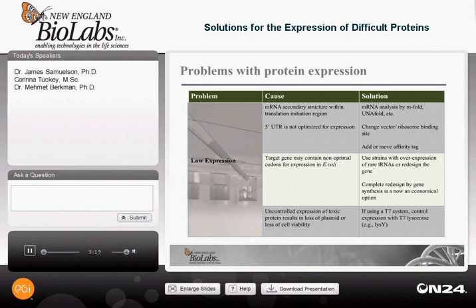Finally, low expression may be due to uncontrolled expression of toxic protein during the culture outgrowth phase. This can result in loss of cell viability or loss of the expression plasmid. Maintenance of the expression plasmid should always be checked by plating cells at the point of induction on drug selection plates versus non-drug plates. Then if the number of colonies on the drug plate is less than 50% of the number on the non-drug plate, then steps need to be taken to stabilize the host vector system. If you're using a T7 system, by far the best way to control basal expression is by adding T7 lysozyme, since T7 lysozyme is a natural inhibitor of T7 RNA polymerase activity.